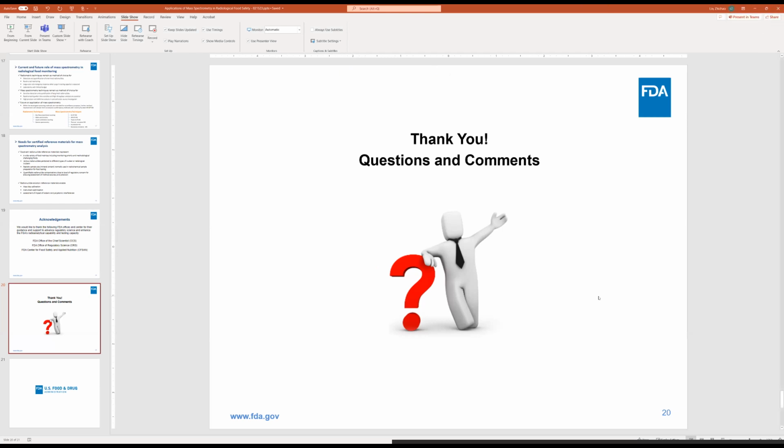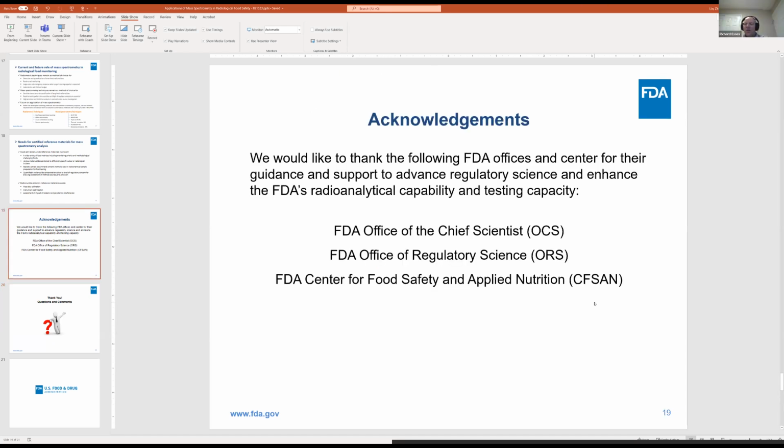Yeah, this is Richard. I have a quick question. With regard to the reference materials, it seems that for some of your measurements, you need a fairly large quantity, tens of grams or more. What if a reference material was pre-ashed? I realize it would be skipping a step of your preparation, but it'd be easier to send you 50 grams of pre-ash than a kilogram or 5 kilograms of something else.